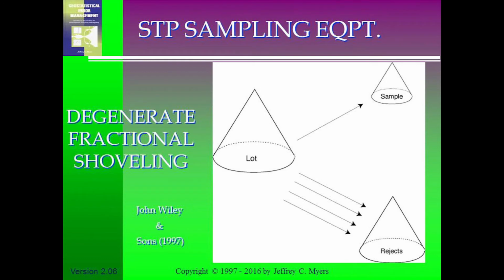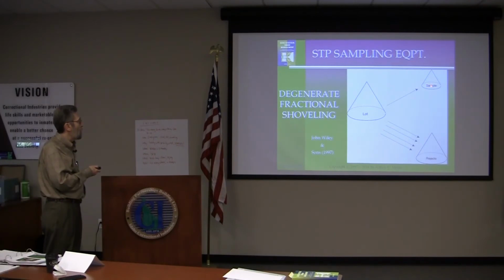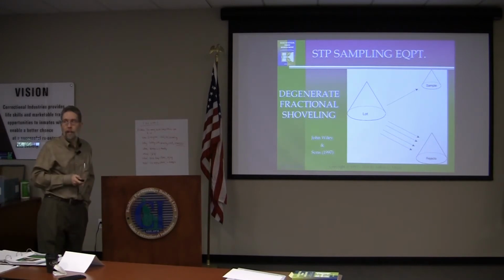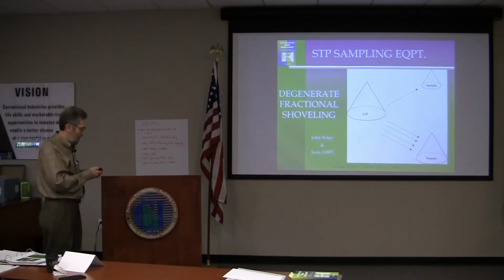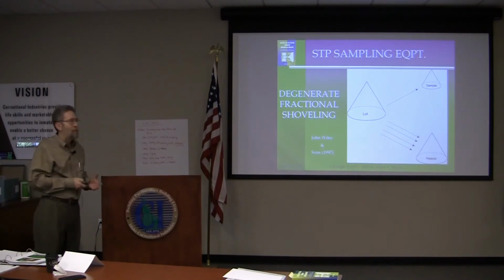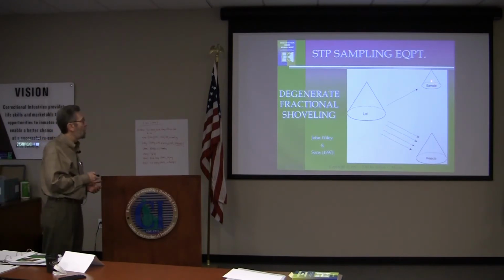Now, people often, again, use this technique incorrectly. If you say, well, I'm going to take 5 shovels, and every 5th one I'll put a sample shovel, and then I'll do 4 over here. You don't want to do that. We all have a subconscious bias when we're shoveling. We don't want to admit it, and even if it isn't subconscious, it creeps in there. And so this is a degenerate form. You don't want to do this. If you want to do 4 and 1, or 4 and 1, do 5 piles and then select one. Don't put 4 scoops here and 1 over here.